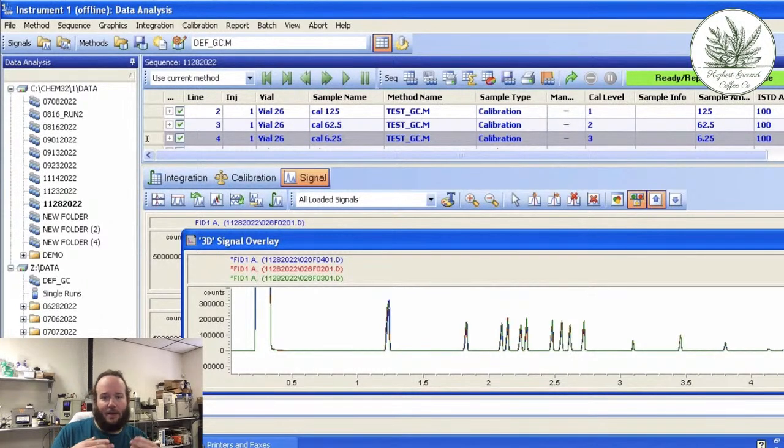So your internal standard on your calibration versus your sample amount might be 3% off. As a result of that, your sample numbers get adjusted by 3% to make them even, effectively. Hopefully that makes sense. All right, so the very first thing over here is, I wish I could make this bigger.